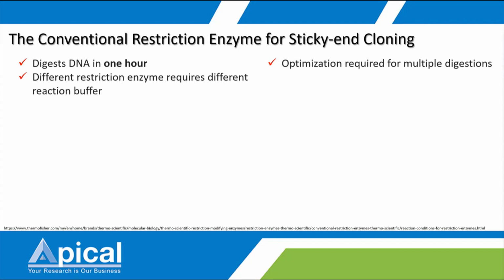It is possible that there is lower digestion efficiency in one RE, something like that.